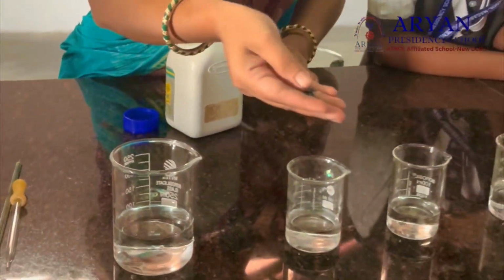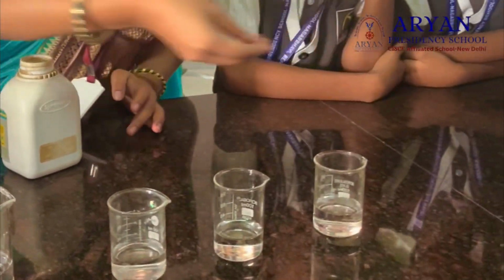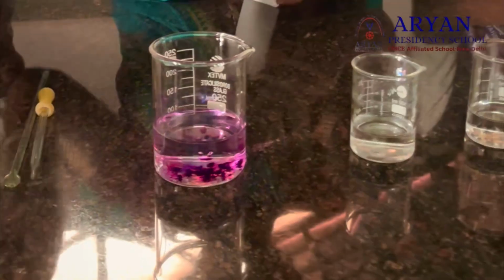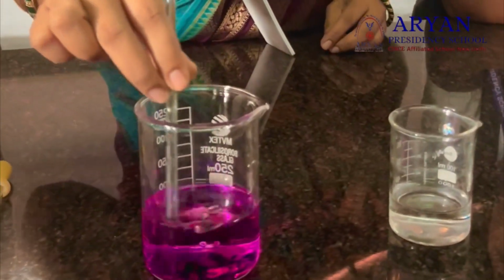Are you able to see this? Crystals, okay? I'll take a few crystals of potassium permanganate. Able to see? Now I am adding potassium permanganate crystals to this water, in beaker A. Understood? Now I'll take this glass rod and I'll stir this.